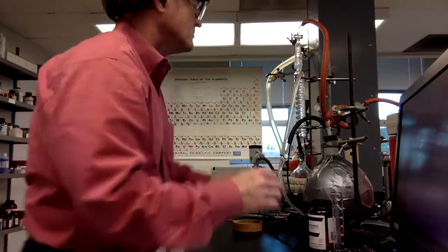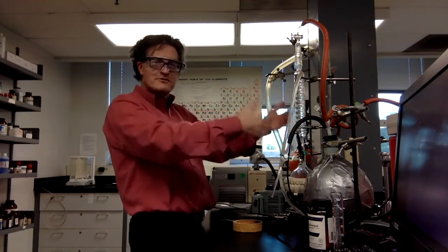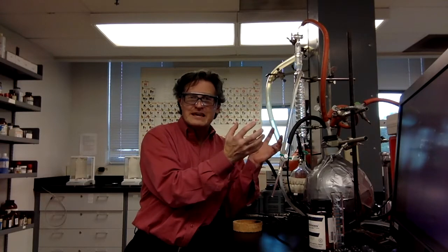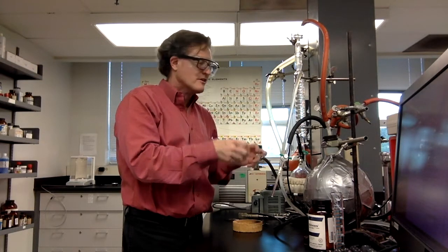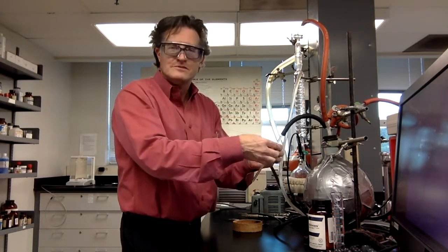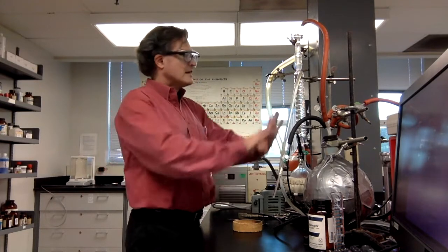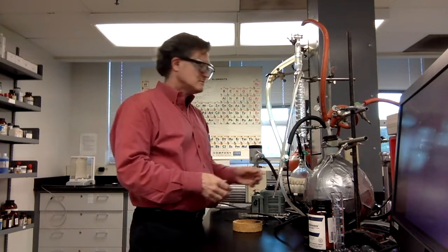We also need to get rid of our sample. How do we do that? You can't get this apart right now. If we want to change samples, this is under vacuum. So don't forget that if you're under vacuum, then the atmosphere is pushing on this thing and holding it together, so you can't get it apart very easily. Besides, you don't want to rip off the thermistor here and have a big inrush. So instead, we gently vent it up to atmosphere. That will get all of this up to atmospheric pressure, and that way we can then take this apart.